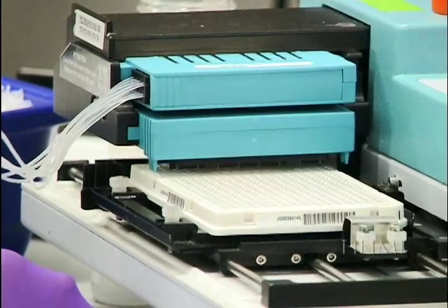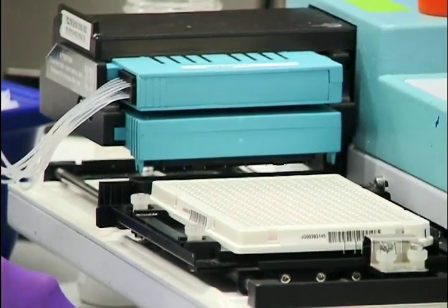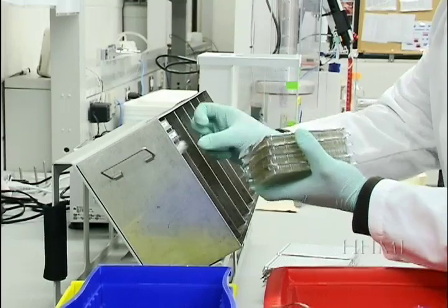We are almost ready to read the DNA sequences, but first we have to crack open the E. coli bacteria and get out the DNA we want to sequence.